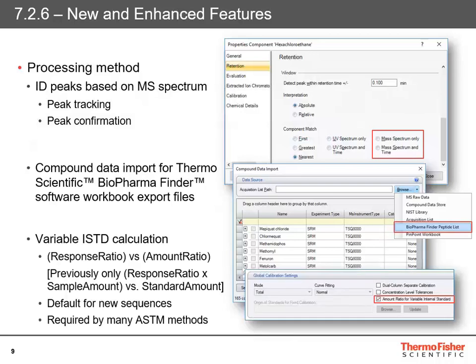There is also a new variable internal standard calculation, mainly required by ASTM methods. It is now a response ratio versus amount ratio, enabled simply by a single tick box in the processing method. This is the default for new sequences. If you uncheck that box, it goes back to the previous calculation, which is response ratio times sample amount versus standard amount.